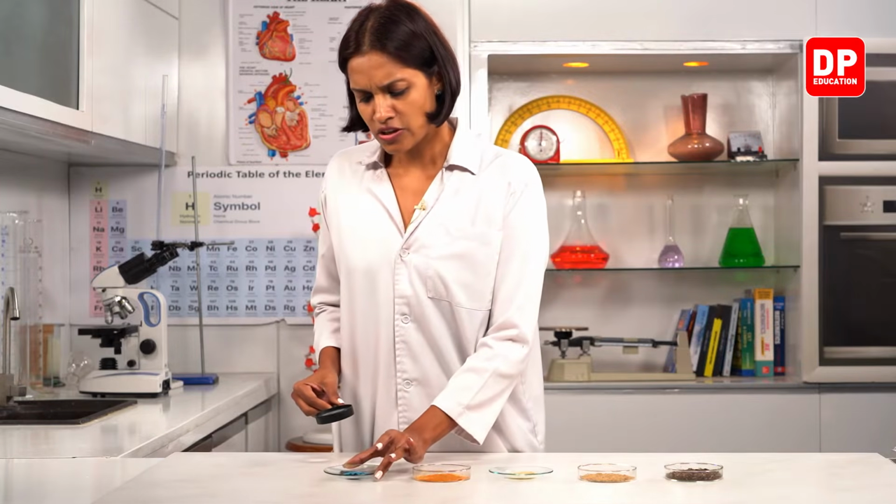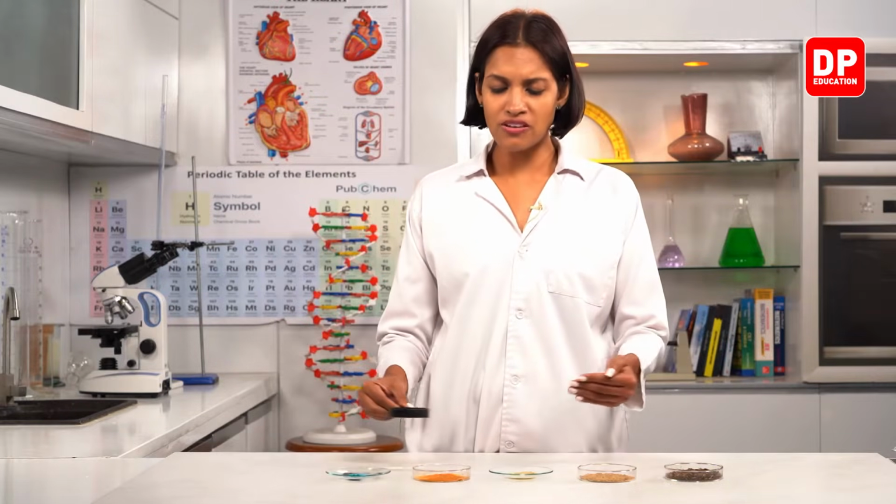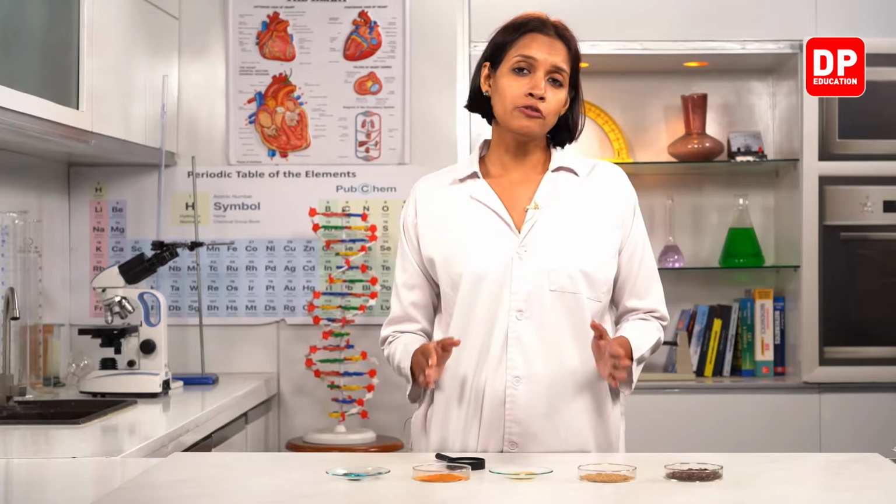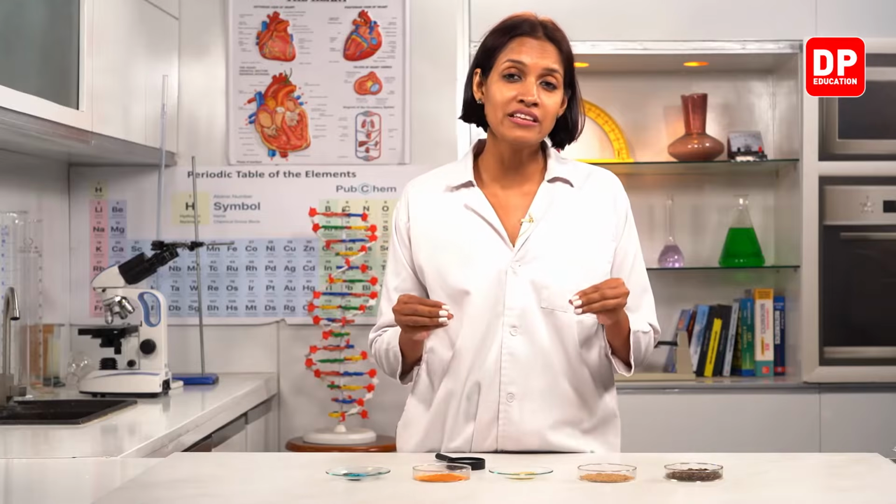Blue color crystals. This is copper sulfate crystals. And the black color substance here on the side, you all can see that black color substance as a powder. That is the iron powder. Right? Mixture of iron powder and copper sulfate, blue color copper sulfate crystals. Right, children? So you also can observe different samples. It doesn't have to be the very same samples that I picked today. You can observe different other samples using hand lens, and you will realize that using the hand lens you can identify the things that are present in each sample better.